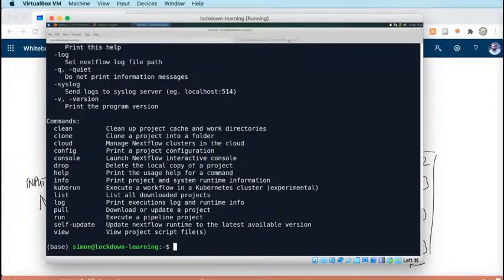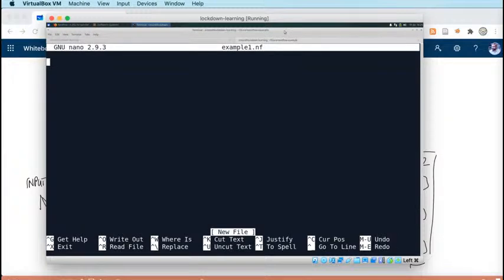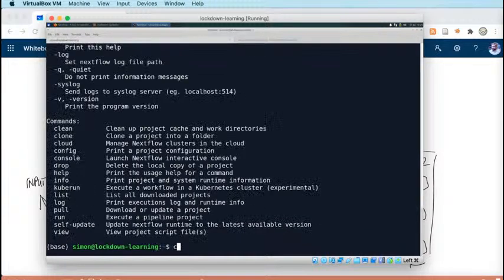So let's start writing our script. I need a hash character. Let's just see if I can type one. No. Okay. Just quickly cat a script from one of the other weeks.